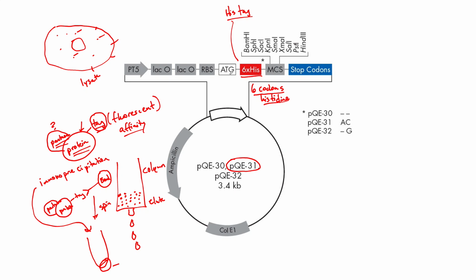Notice that right before that there is an ATG sequence. So this is a start sequence.